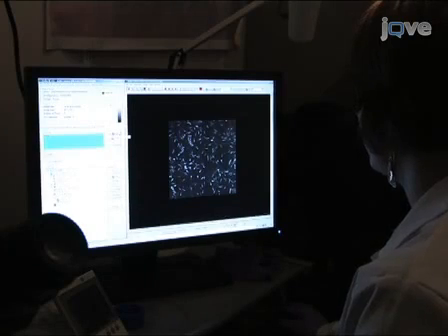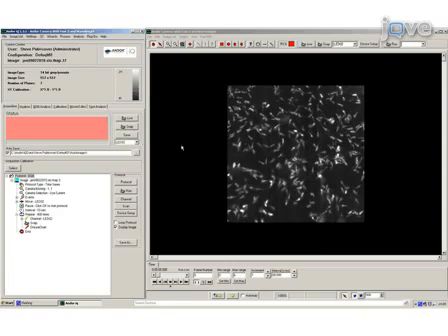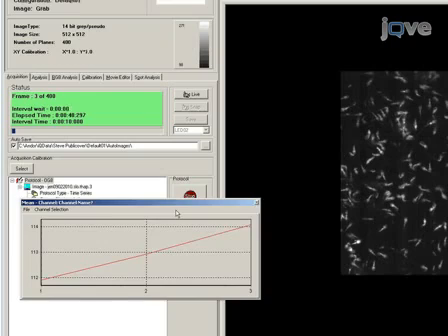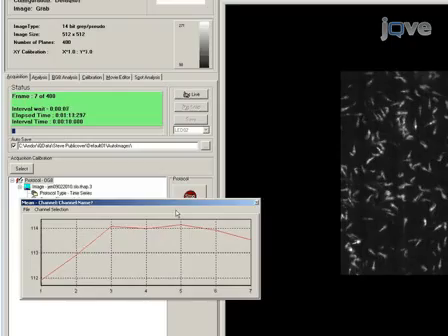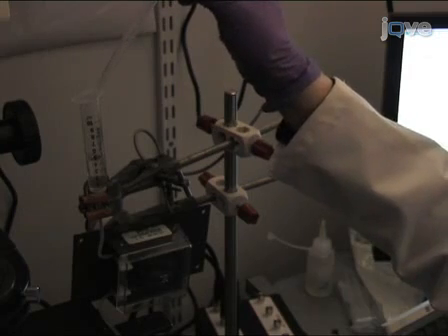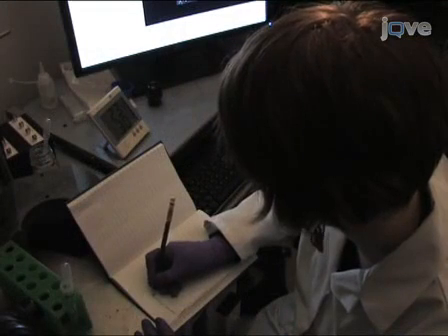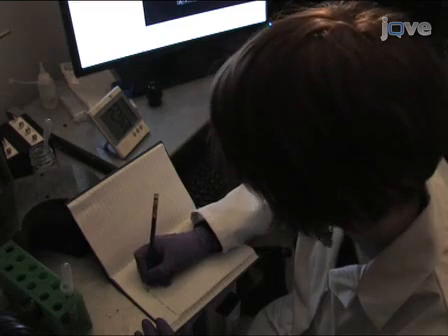In IQ software, activate the time series image acquisition. Acquire images at 0.1 Hz and use a software-controlled shutter to limit illumination, initially recording for a control period of 3 to 5 minutes. Manipulate the saline's calcium concentration and apply drugs by changing saline at the header of the perfusion system. Note the time that each stimulus is added to the header and calculate its arrival time in the chamber as described in the written portion of this protocol.